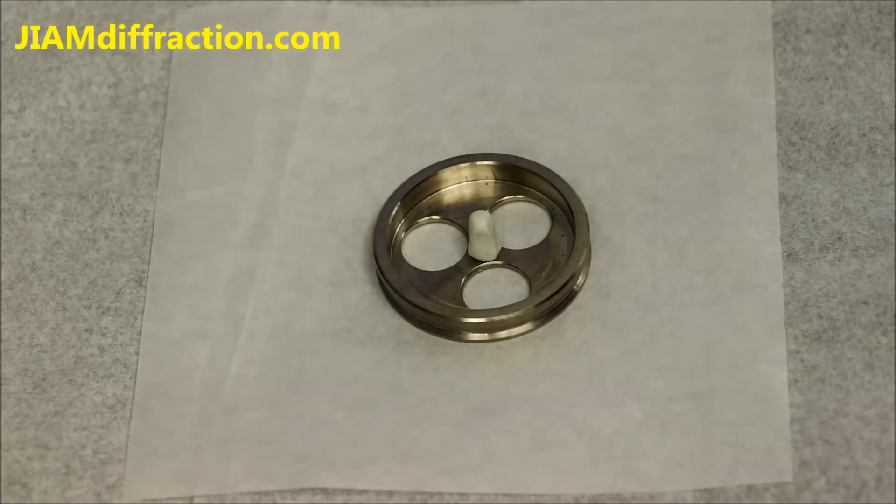Hello, my name is Michael Koehler and I am the lab manager for the JIAM diffraction facility located at the University of Tennessee Knoxville. In this video I will show you how to prepare a solid sample using a holder from Malvern Panalytical.